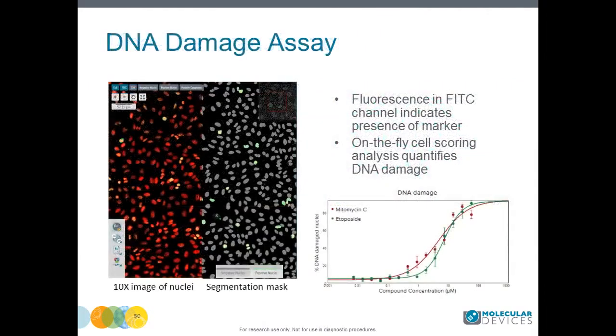DNA damage is another important application for toxicity assessment. Assessing damage to DNA is frequently addressed in research applications because of its implications in diverse diseases, including genetic mutations, cancer, and aging. DNA damage may happen spontaneously or be a result of exposure to ionizing radiation or chemical compounds. Cellular DNA damage can be visualized and quantified using antibodies against phosphorylated H2AX protein. Also, we have used the nuclear stain Hoechst for counterstaining.